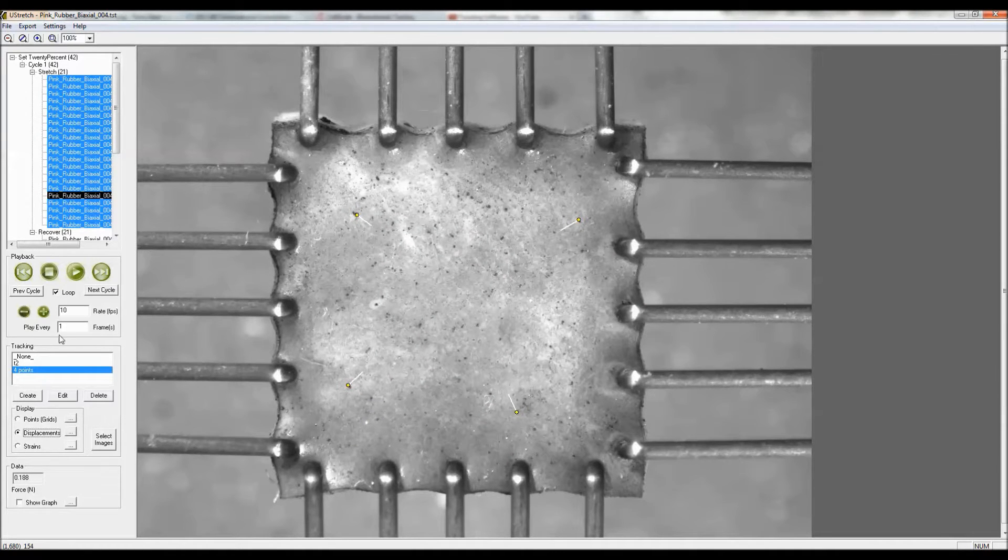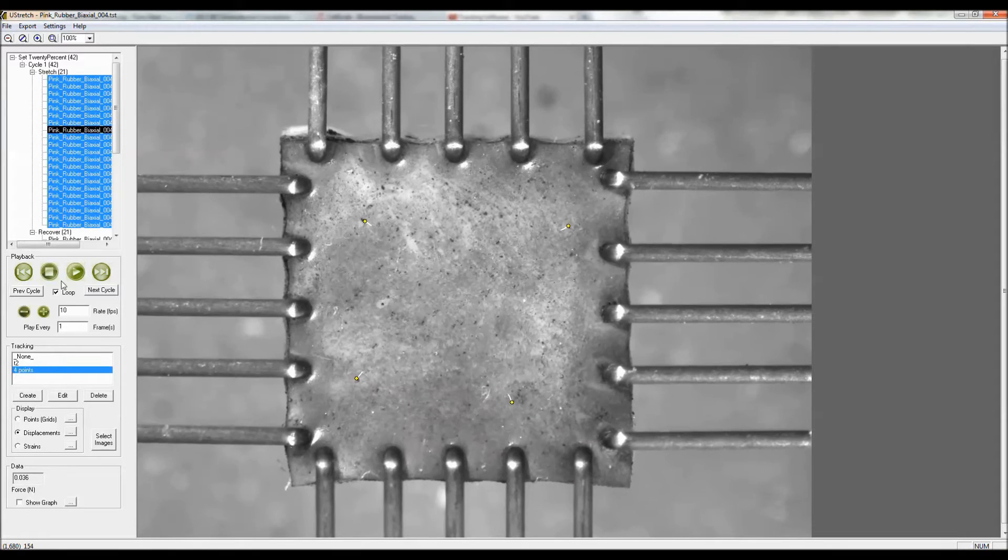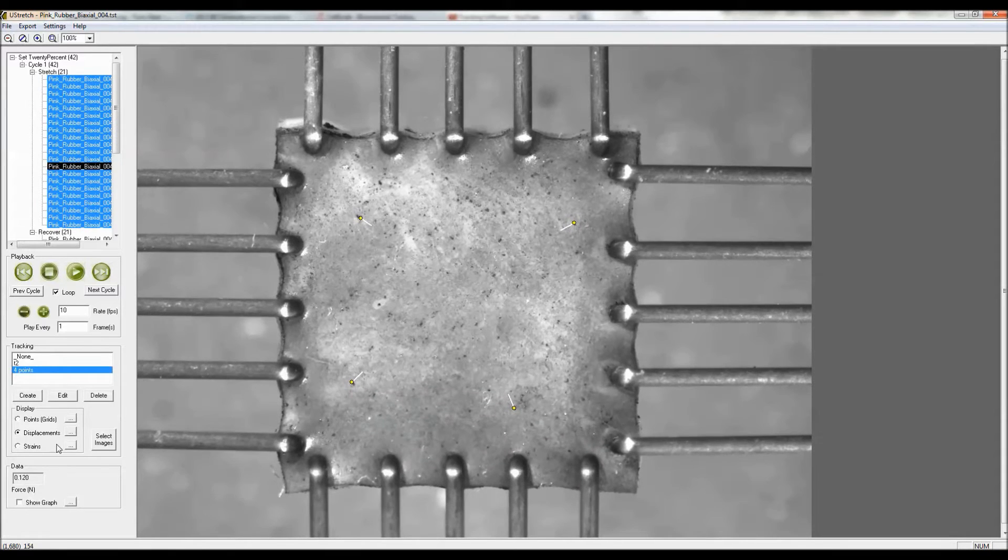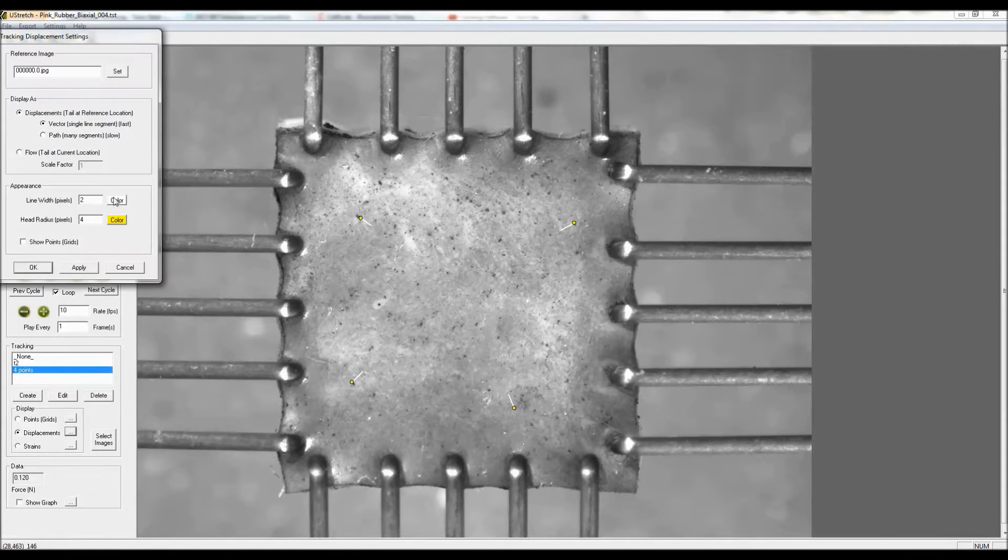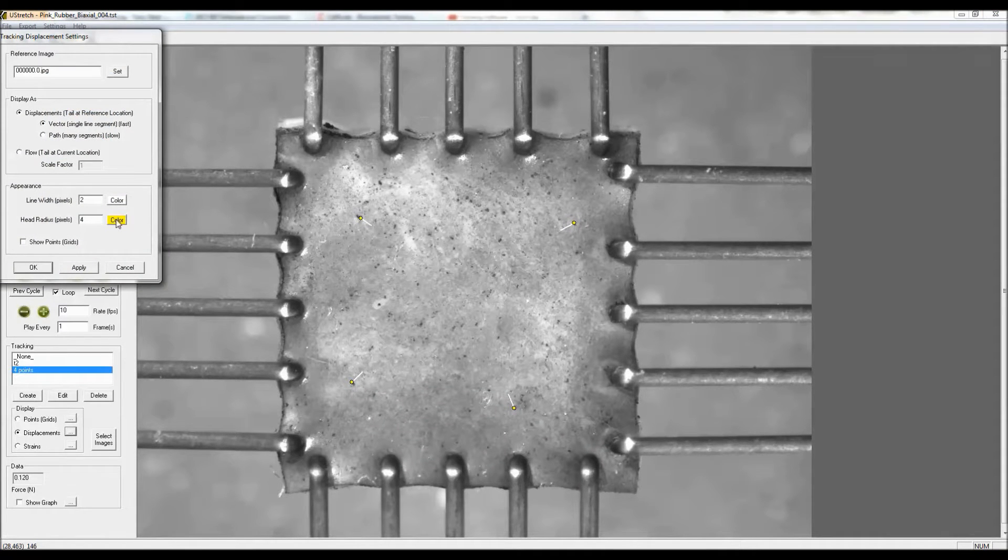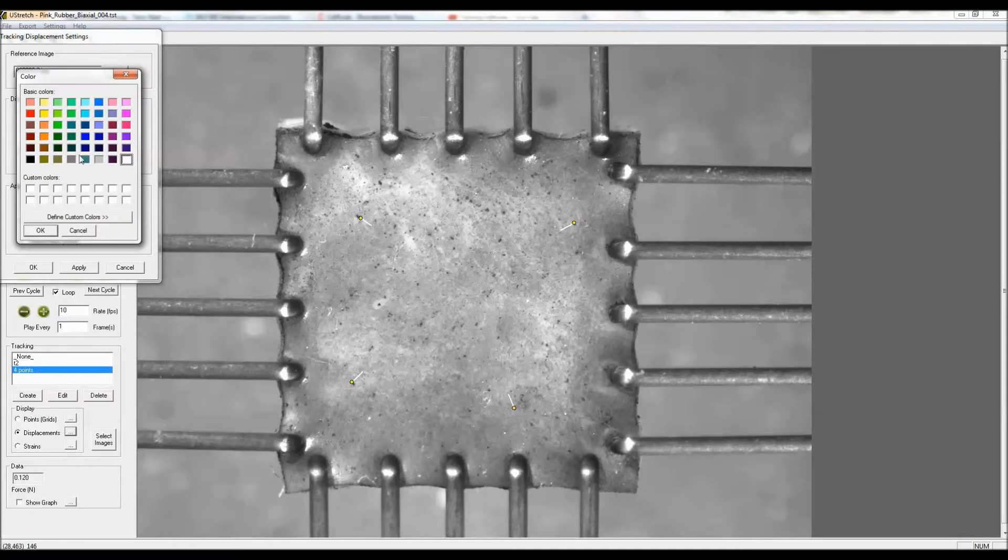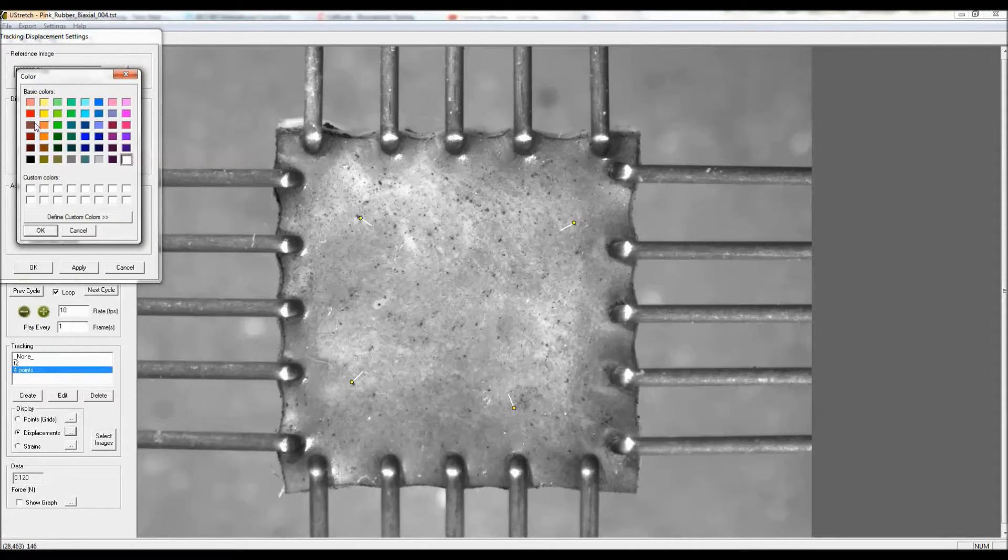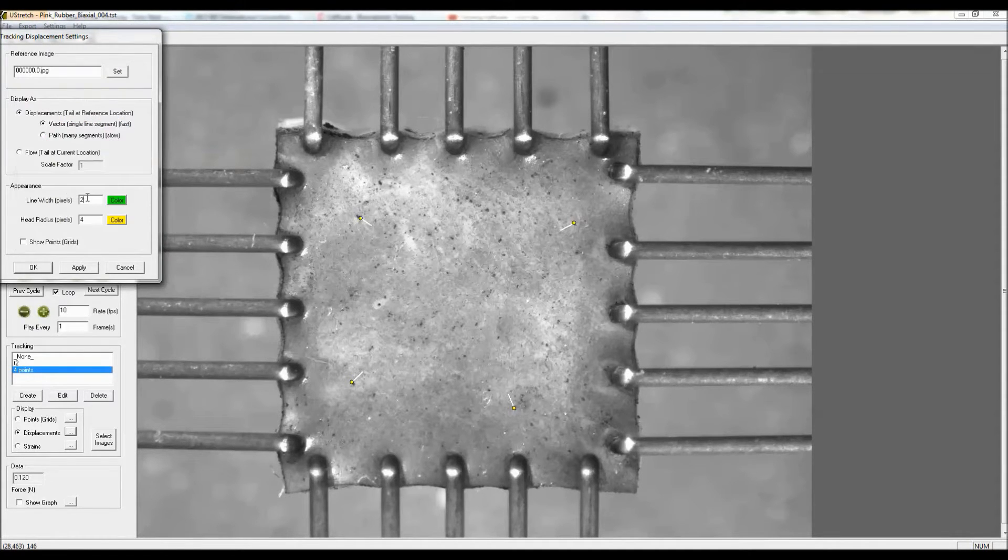What I'll do is also play it back showing the displacement. I'm just going to change the coloration of that a little bit so you can see the line more clearly. I'll show it in green for example.